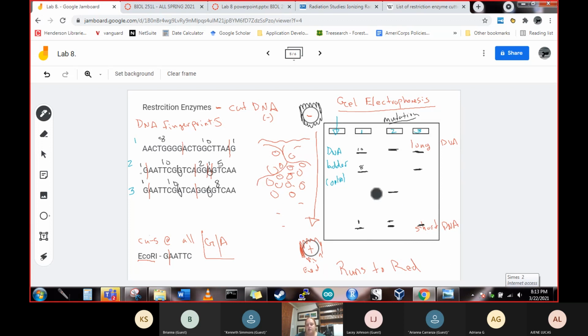Imagine that this was a paternity test or something like that. We might think that these two people might be related, or they might be the same strain of bacteria or something like that. And this is one way that you can trace diseases. If you're thinking of COVID-19 and it has different variants, your COVID-19 is probably going to look like 1 and 3.